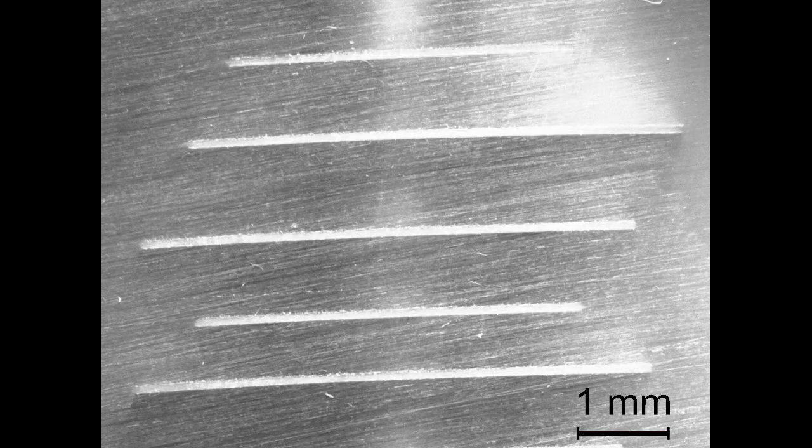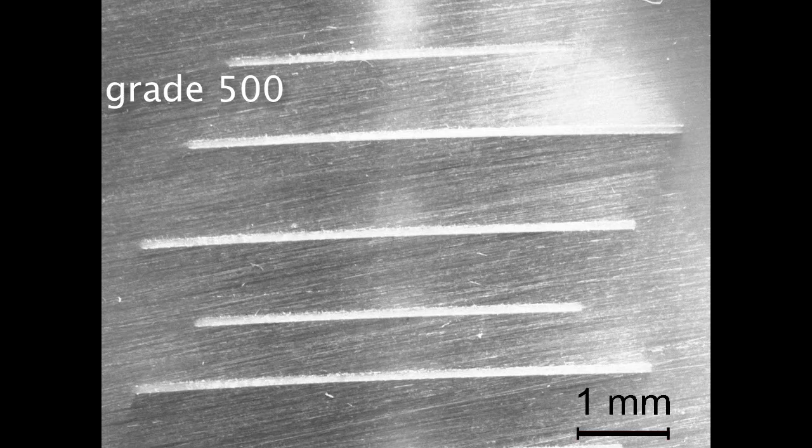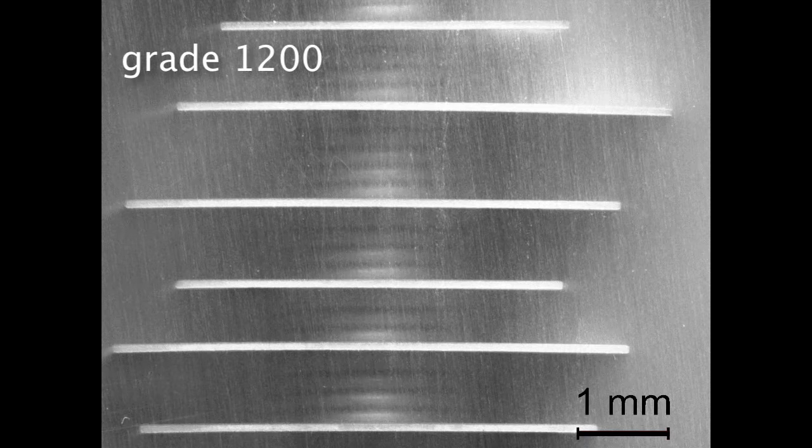So here you see a low magnification image of the sample after it's been grinded with the 500 grade paper. You see also that the grinding marks go from left to right horizontally. The next image shows how the lines go when we reach grade 1200. Here the lines are vertical.